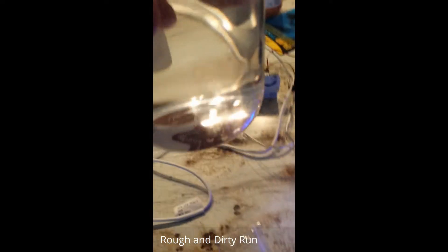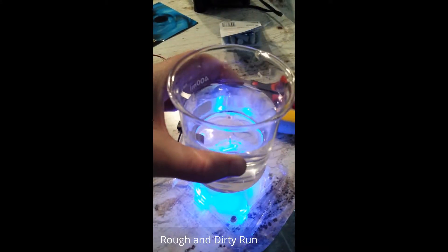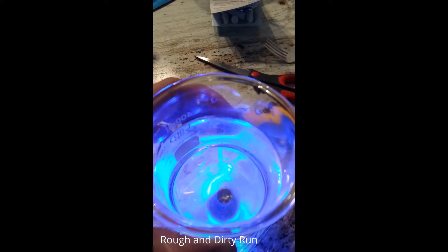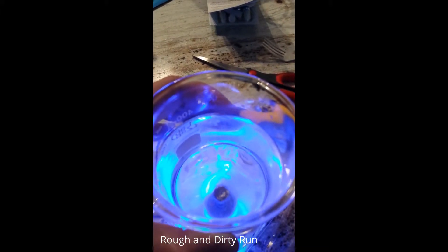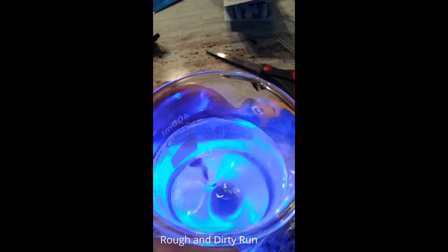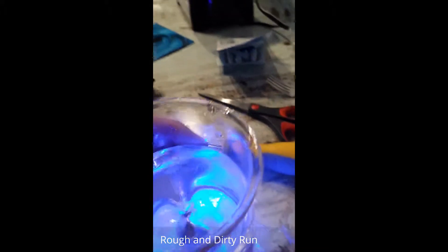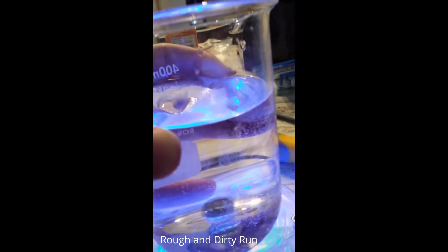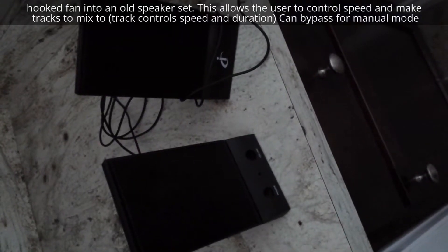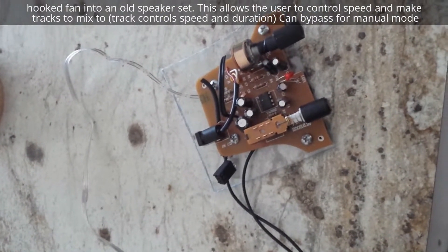I've put magnets at the bottom of the speaker here. I had an old speaker laying around that I mutilated and wired into my fan to make it so I can control the speed and turn it on and off.